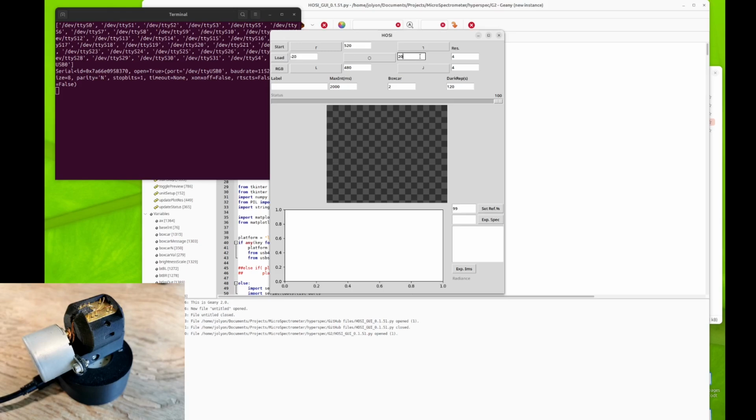So that's the horizontal, and then we've got the vertical, the tilting angle. So this is the topmost point and the bottommost point, and the resolution in that plane as well. So we can specify horizontal and vertical resolution independently.